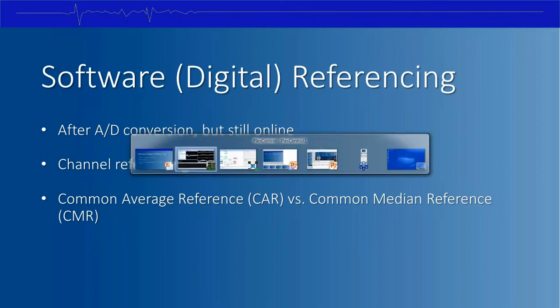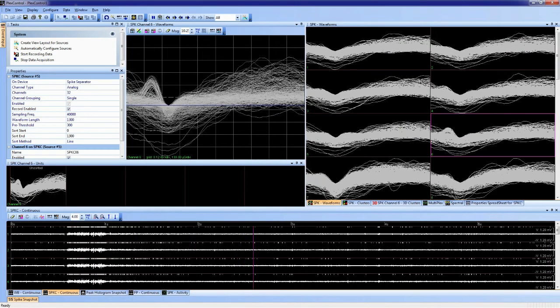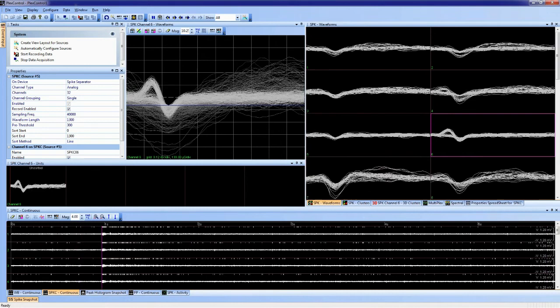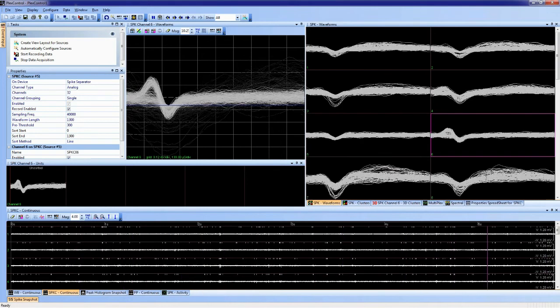Let's jump back into Plex control. It might be the case that the displays that you're seeing here aren't updating over the webinar as quickly as they are for me. Know that when you're doing it yourself, you should be able to see this in a much clearer way.